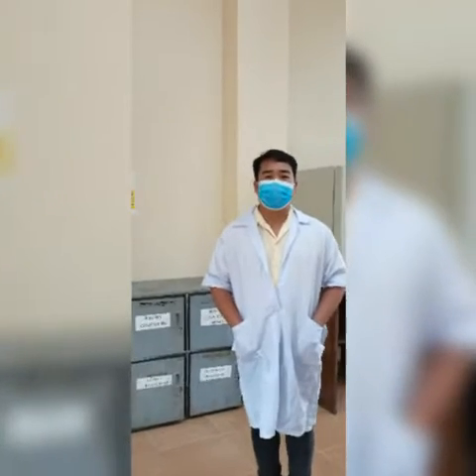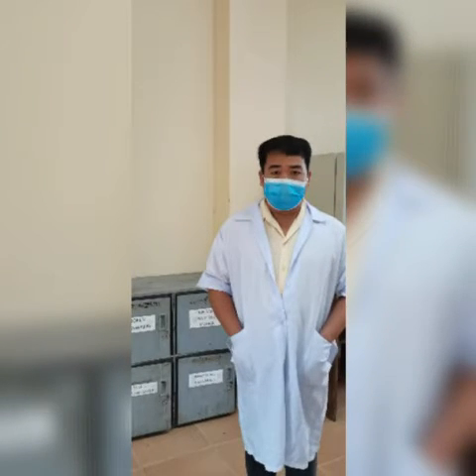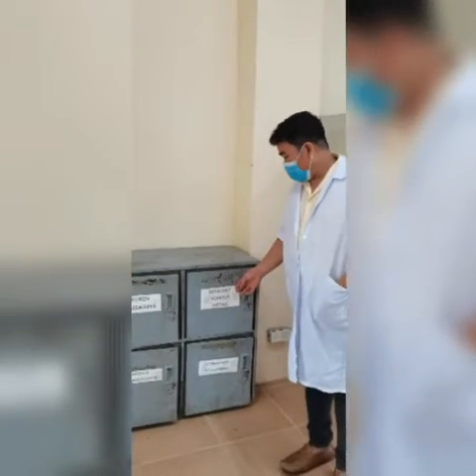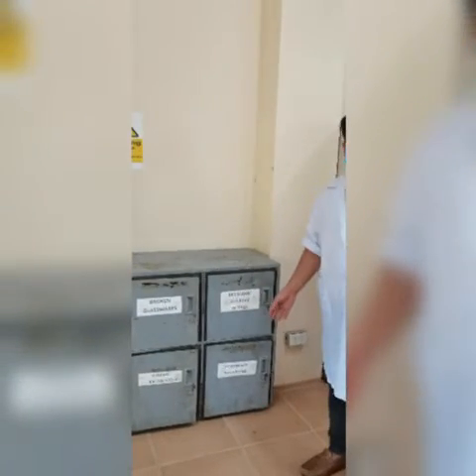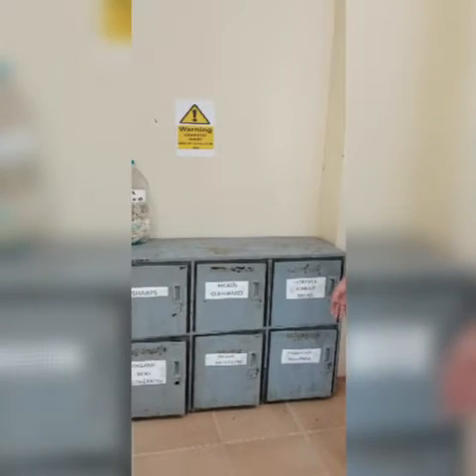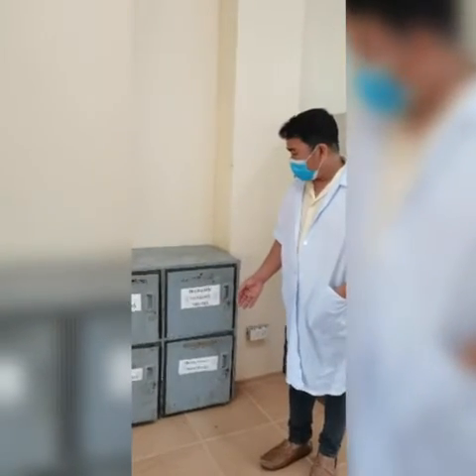The WVSU laboratory waste disposal. The waste or the garbage of the laboratory are being processed in different ways. First, the chemical waste is kept inside storage containers. They are accordingly labeled based on their category or types. We have the inorganic waste with heavy metals, and we have the inorganic waste without heavy metals. Reminder, heavy metals are, for example, mercury, lead, and arsenic, which are commonly used inside the laboratory.